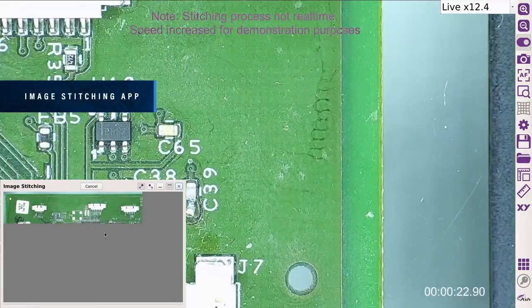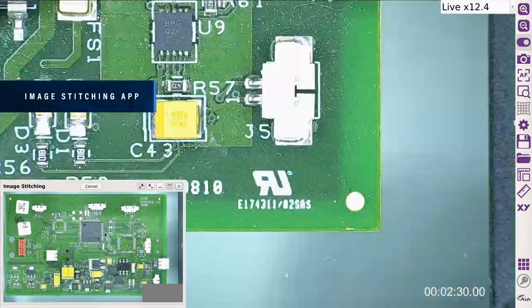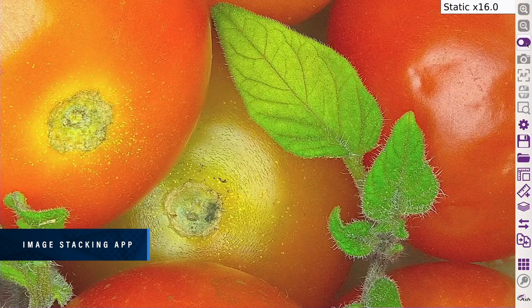Stitch multiple images together, increasing your field of view at high magnification. The Enhanced Image Stacking app improves image focal depth to create one high-quality, fully focused sharp image, allowing easy and fast inspection.